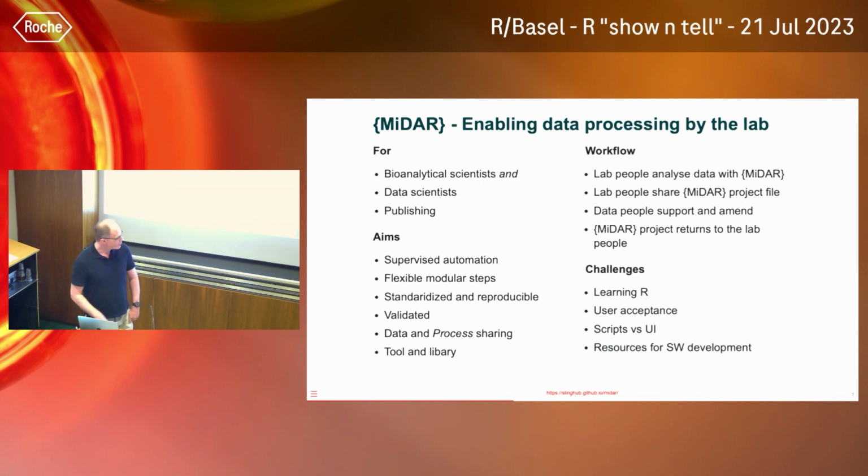It should be flexible enough to tailor to all the different methods and requirements we have. It should be standardized, so that we have standardized output formats and standardized reports, and it should be reproducible, of course. The idea is that you are able to share the data, but also to share the processes by which these data were prepared.